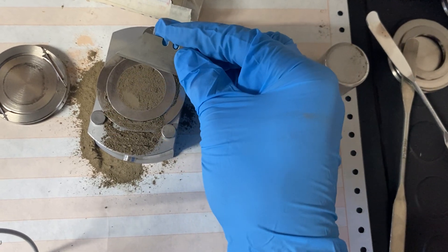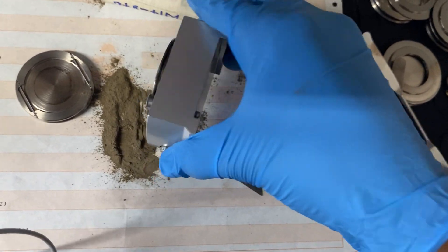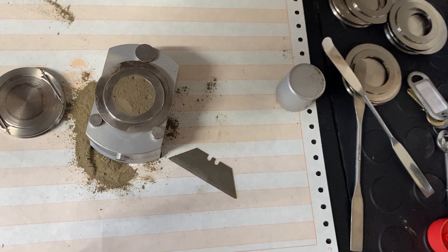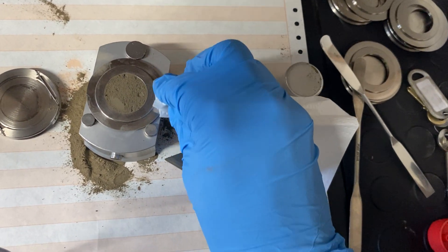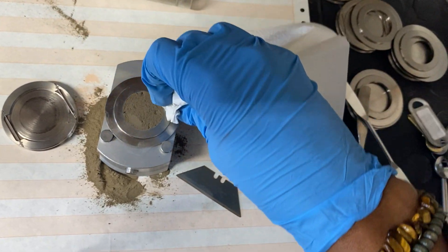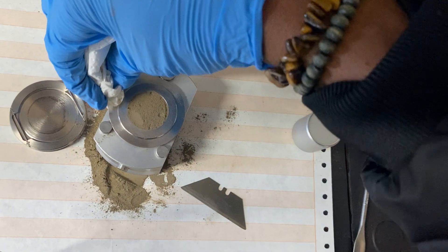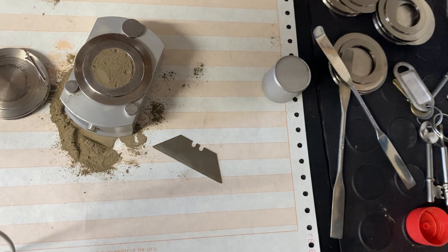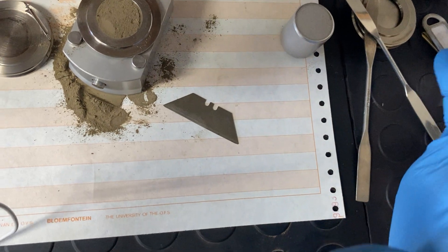We can repeat this scraping step to make sure that no loose powder interferes with the analysis. We clean around the edges of the well carefully, and then use the paper towel to wipe away any remaining traces of powder around the sample holder.